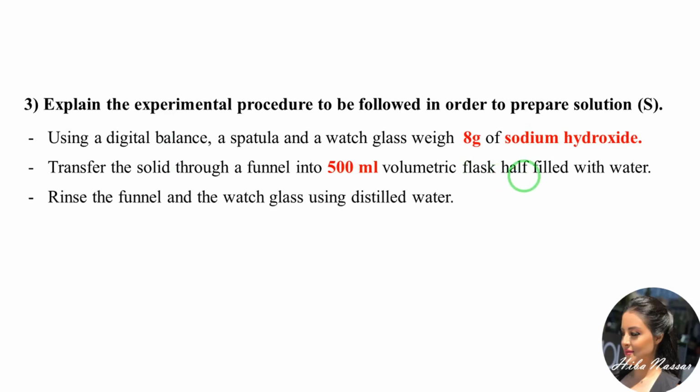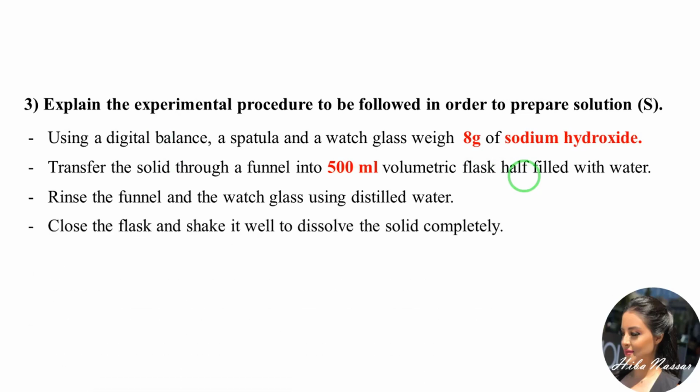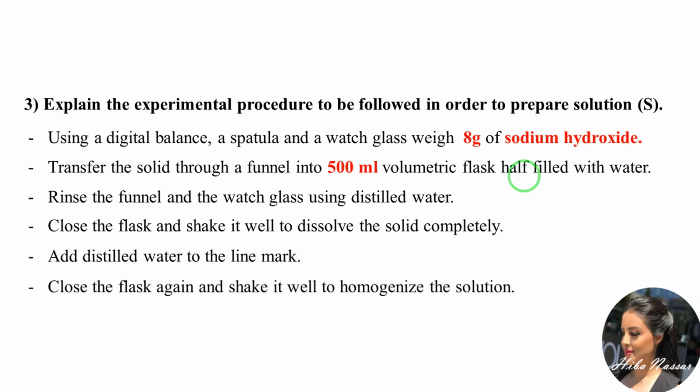Rinse the funnel and the watch glass using distilled water. Close the flask and shake it well to dissolve the solid completely. Add distilled water to the line mark. And finally, close the flask again and shake it well to homogenize the solution.